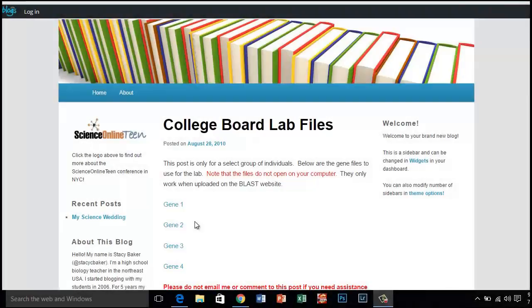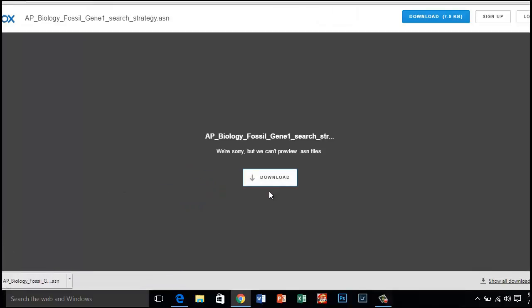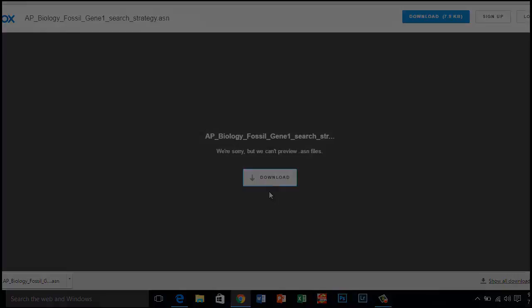The first thing you need to do is to download the gene files from the Blogging for Biology website. I have placed the link on the Google Classroom. Once at the site, all you need to do is to click on the gene and click Download. You may want to save these files to your desktop for easy access later.